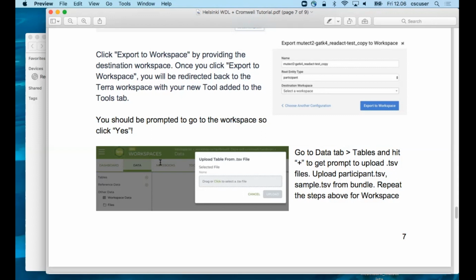So what we'll do is, all we need to do next is run it. I'll explain this data model. We'll run this, and after lunch, we'll take another 5 minutes to go over the steps again. Sound good? Okay. So what we did just now is create a data model. It's totally understandable if it's a little confusing, but let's try to figure it out. The TSV files that we were looking at essentially have this data that you see in front of you in a TSV format.